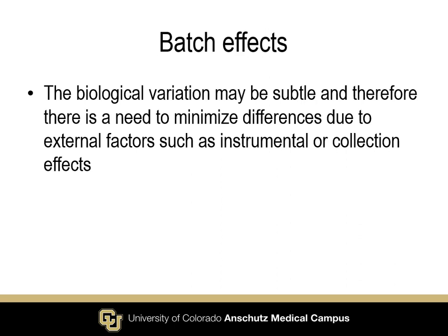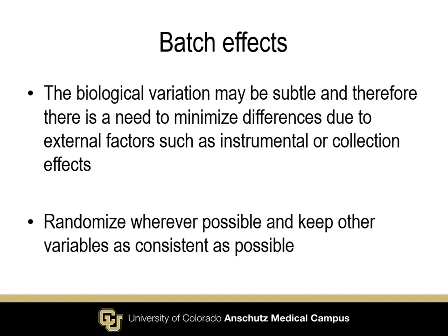And so we have to minimize these differences due to external factors like extractor, day of extraction, instrument issues, because obviously our instruments don't perform the same way every single day for 365 days of the year. And we also need to try and randomize whenever possible to keep other variables as consistent as possible.